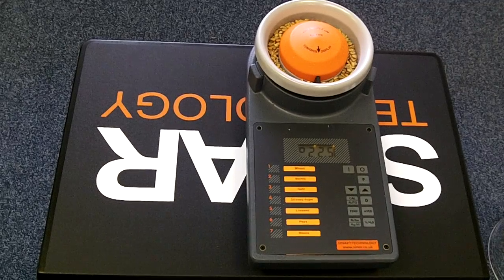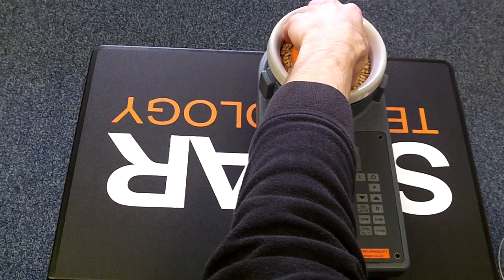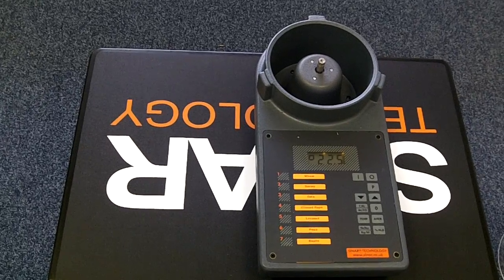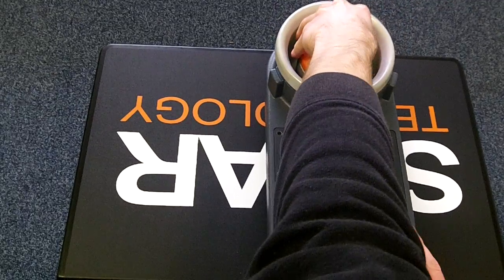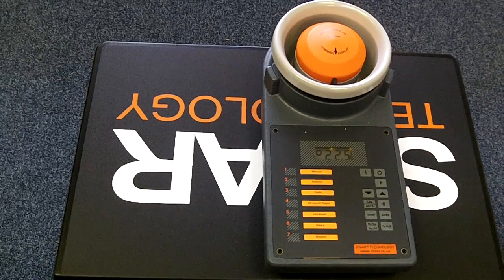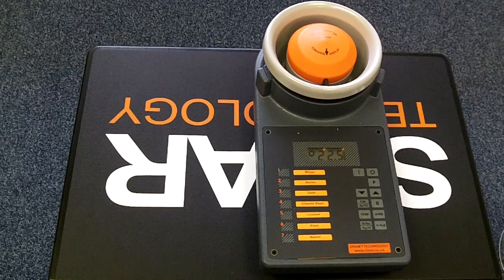To remove the sample from the instrument turn it towards the seven o'clock position and lift it gently. You can then discard the sample and replace the sample cell, and you're ready for the next reading. That's how to use your AP6060. If you have any questions at all, please feel free to get in touch with us.